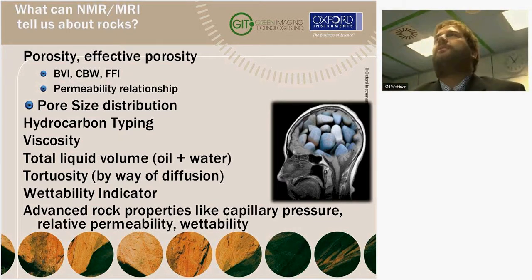So NMR tells us about rocks. There are any number of things that we can tell. Historically, NMR has been used to look at pore size distributions. So signal lifetime T2, if you will, tells us what the pore size distribution is, and I'll describe that in a little more detail in a minute. Now we can get bound and free fluids, clay-bound fluids. People have developed permeability relationships associated with that. It's really been the cornerstone of NMR use in the oil and gas sector since it was invented by, I guess, the folks down at NUMAR in the U.S.